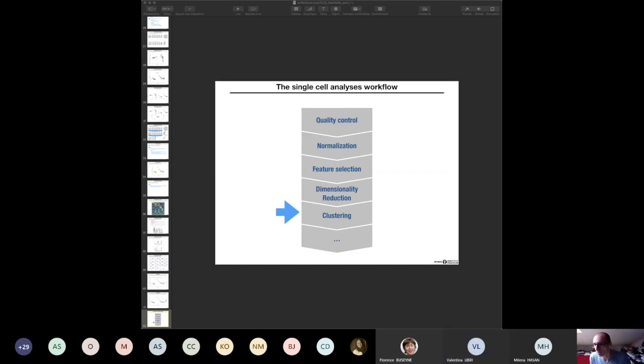That's something that was observed. In the paper I mentioned, they followed dying cells and characterized them, and it was associated with a high number of mitochondrial genes expressed. When you have a disruption of the membrane, the mitochondrial genes stay inside the mitochondria and tend to be sequenced, whereas the cytoplasmic RNA is diluted and not sequenced. So the dying cells trap the reads for the mitochondrial genes.